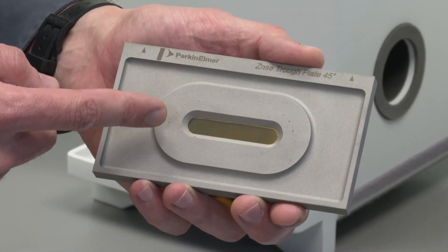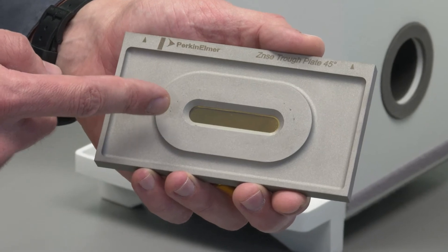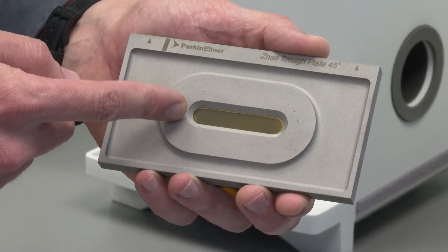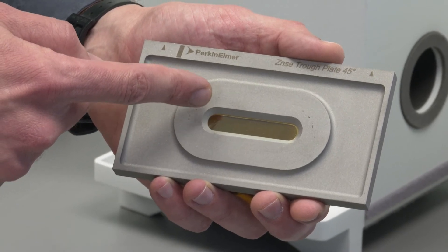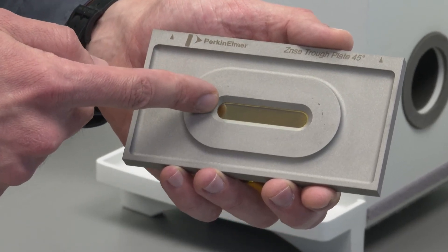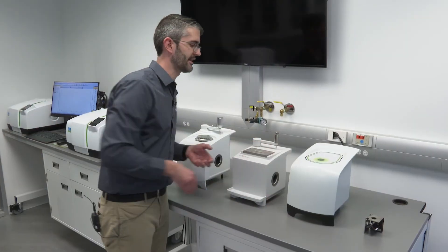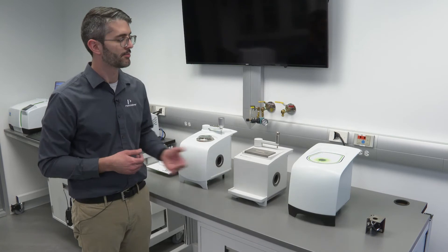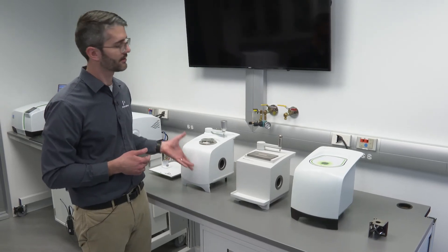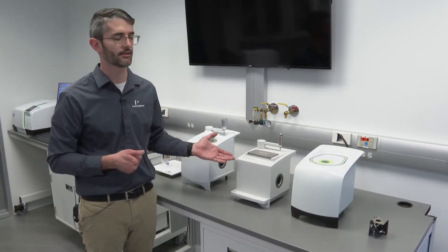Looking at the top plate here, you can see that the area of the measurement is much larger. A slightly higher volume of sample is required, and sometimes cleanup may be a challenge. These are several factors which affect the decision in selection of sampling accessory between a single-reflection ATR, multiple-reflection ATR, or horizontal ATR.